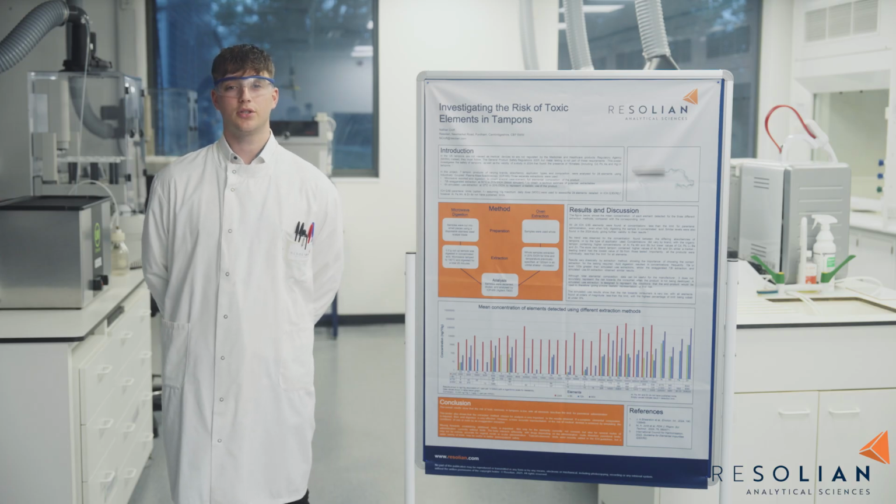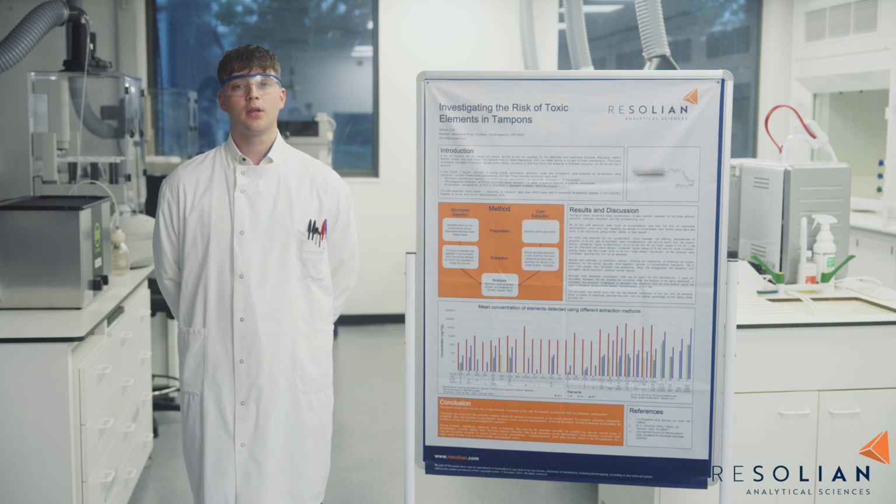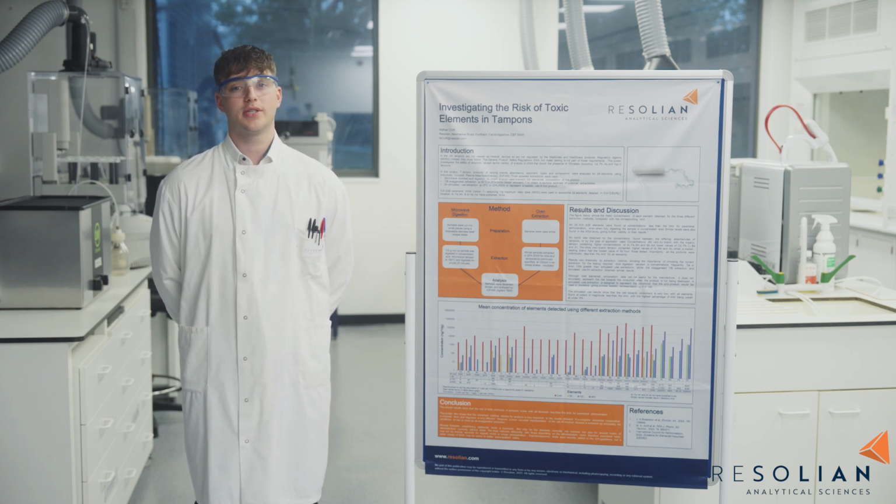In this project, tampon products of varying brands and absorbency were analysed for 28 elements using ICP-MS. This was to replicate a study in 2024 that found the presence of 16 metals or metalloids in tampons. But were these results anything to be worried about? 3 separate extractions were used to assess their impact on the recovery of elements.